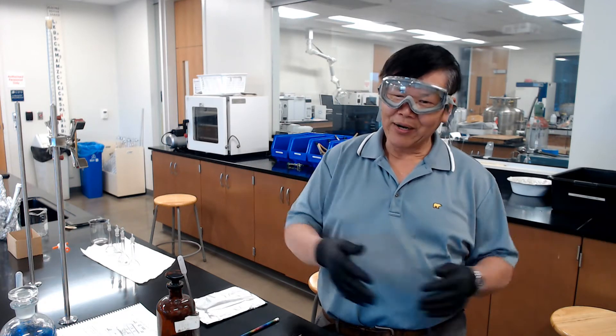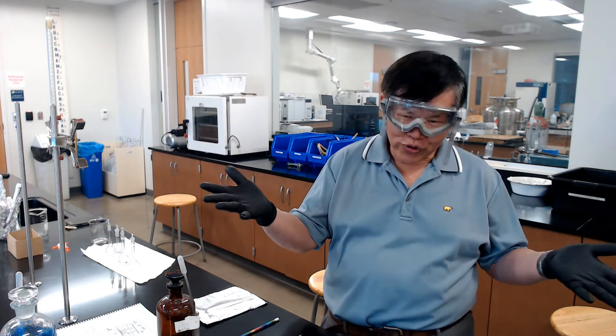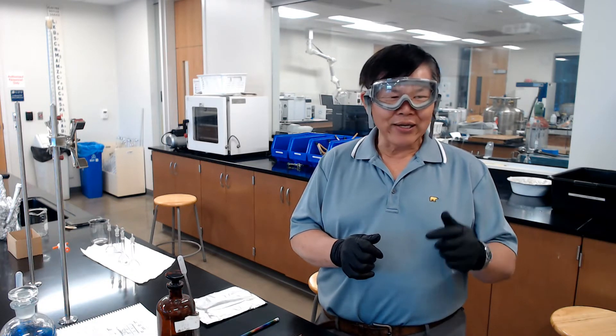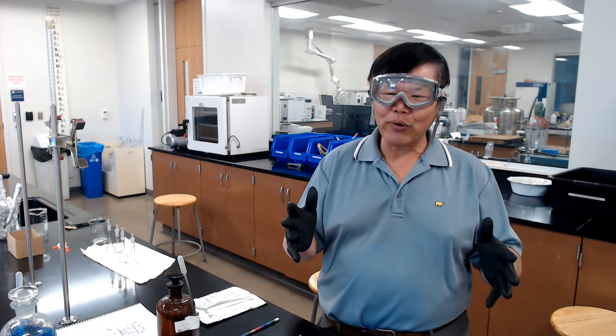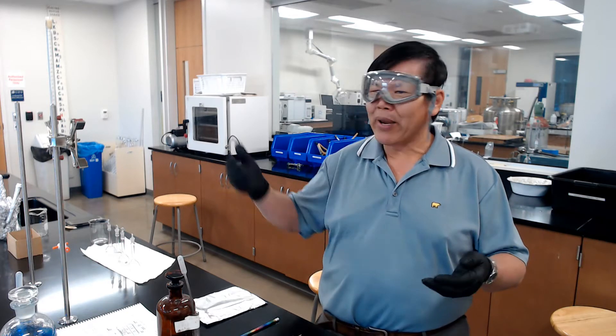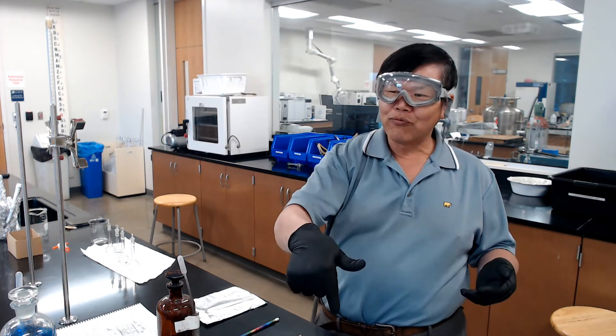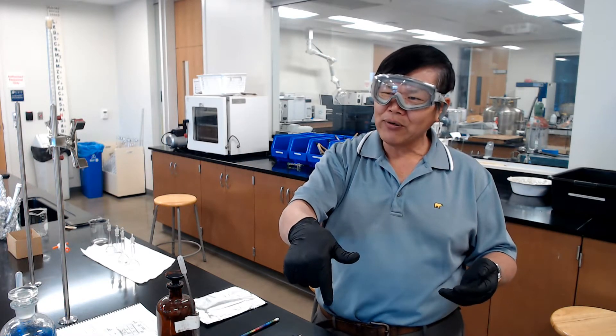Alright class, I'm going to show you how to do the silver acetate lab. This is a two-week process. The first week you prepare the silver acetate solution by reacting with copper. Then in the second week, you make a standardized copper solution and read it with a UV-Vis spectrometer, then take the three samples from the previous week and put them into the spectrometer.